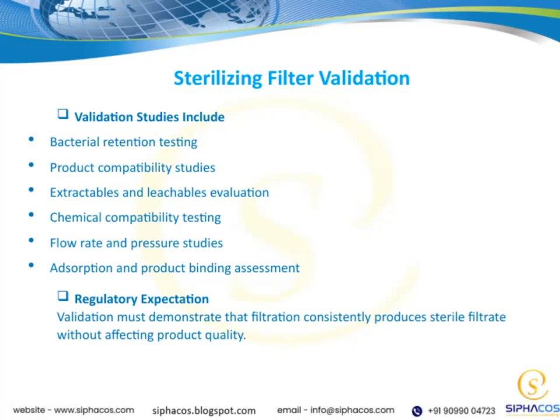Now, let's talk about sterilizing filter validation. When we validate these filters, there are several key studies we need to include to ensure everything is up to standard. First, bacterial retention testing is crucial. This shows us that the filter can effectively remove bacteria from the product. Next, product compatibility studies help us confirm that the filter doesn't negatively interact with or damage the product itself.